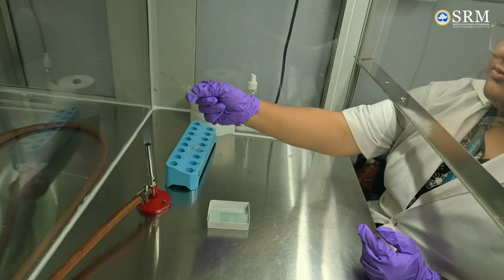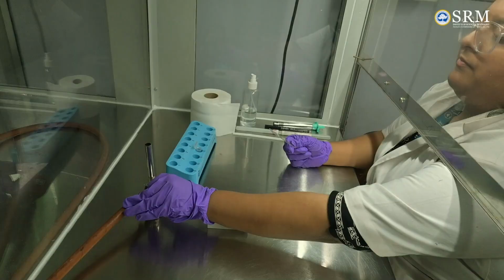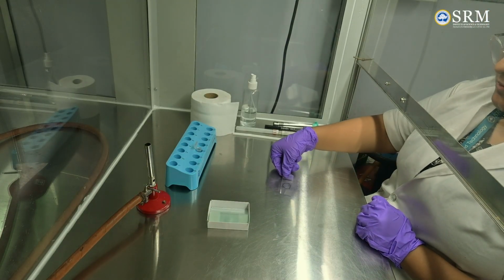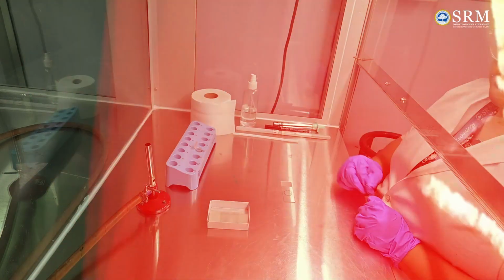Our slide is now fixed. We turn off the flame. And now we move to the following procedures.